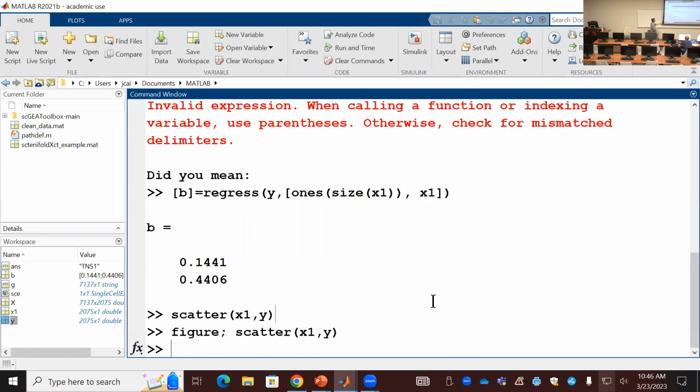When you use this, one thing you need to remember is that all the vectors are column vectors. You cannot put in a vector which is 1 by n, it has to be n by 1, and then you have each variable in a column. So that's why we have to transpose the original rows from the big X matrix, because each row is one gene. We have to transpose it in there.